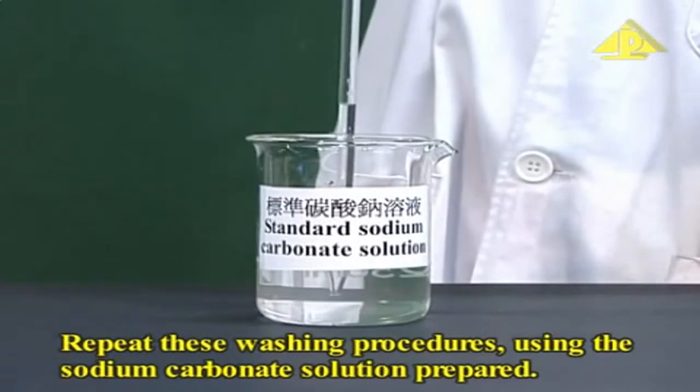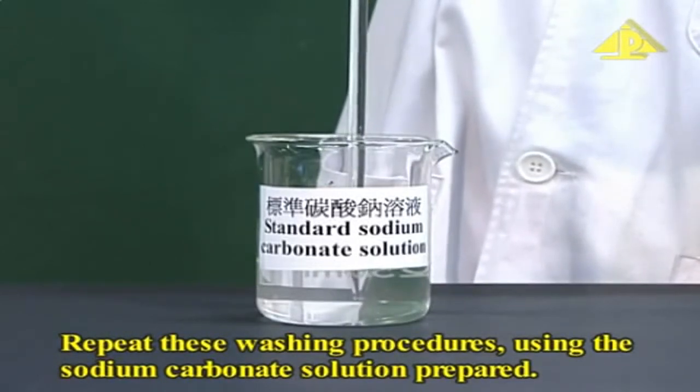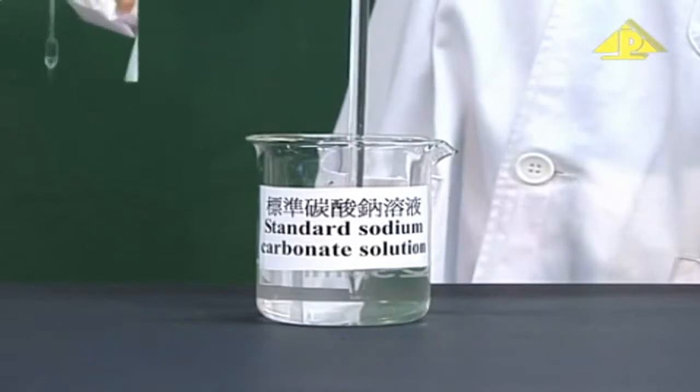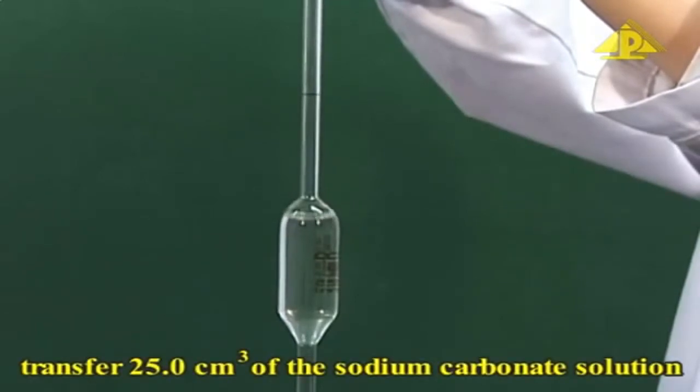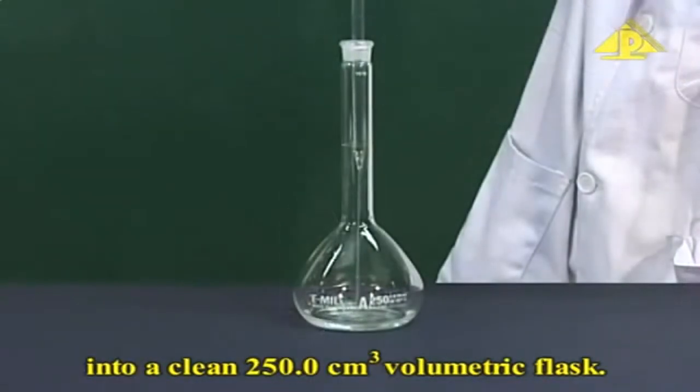Repeat these washing procedures using the sodium carbonate solution prepared. Using the pipette filler and the washed pipette, transfer 25 centimeters cubed of the sodium carbonate solution into a clean 250 centimeter cubed volumetric flask.